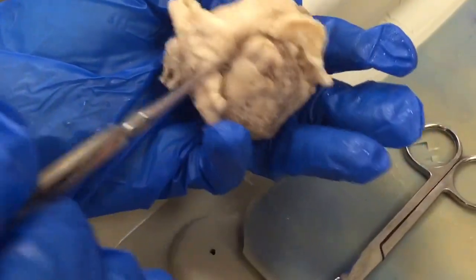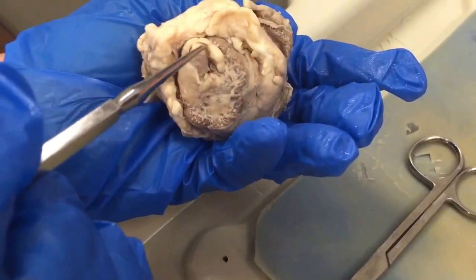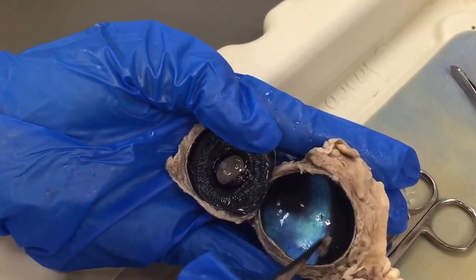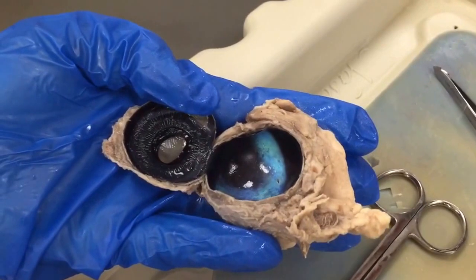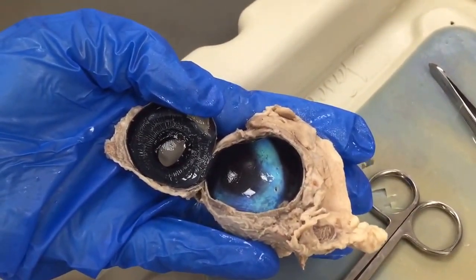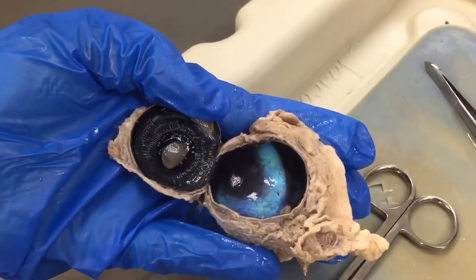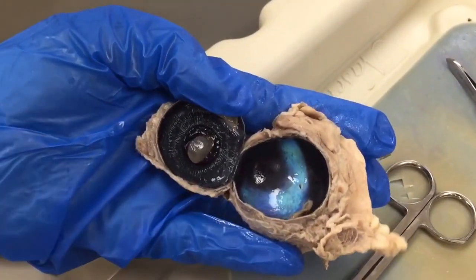So here's your optic nerve coming in the back side, and then this little spot in the back is the optic disc, and that's like your blind spot. You guys have probably heard of certain tests in the eye where your brain tricks you — it uses your other eye to cover up the blind spot, but you can do certain tricks and see it.